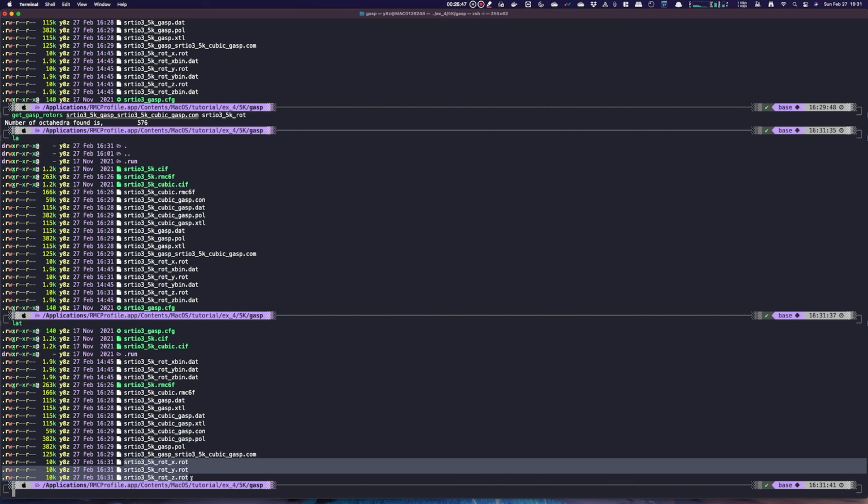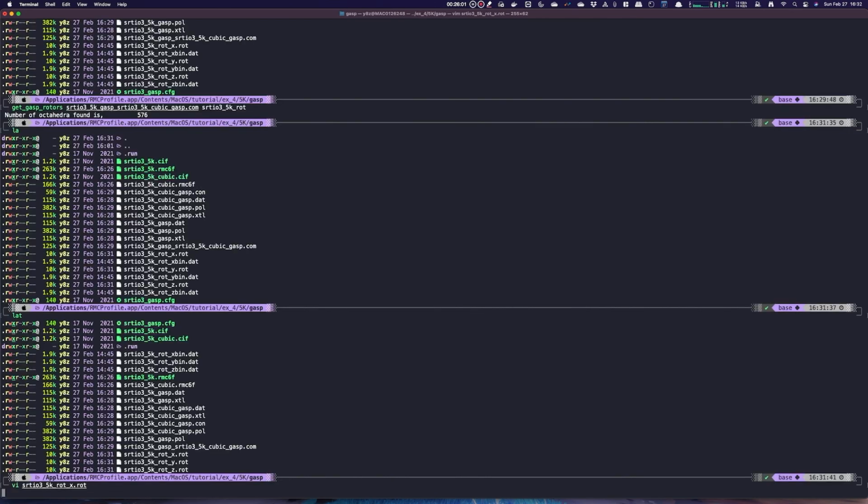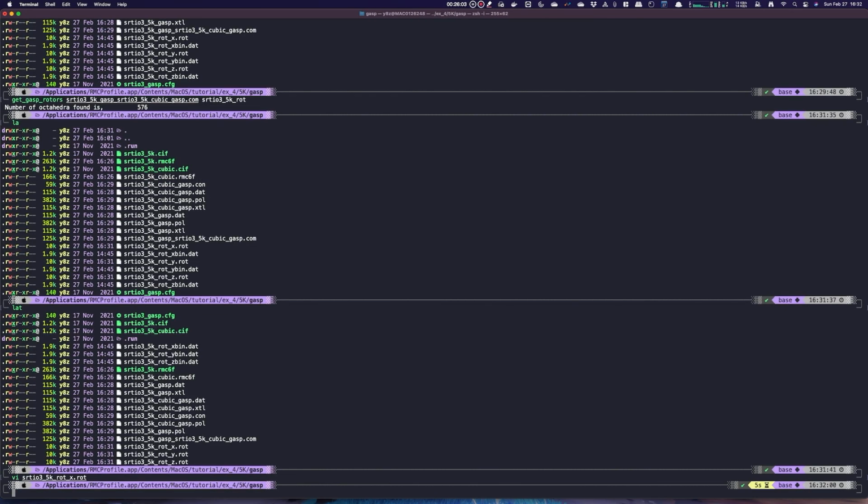And one further step is to transform those files into histograms so we can just plot them. Because if you open those files, they just contain a whole bunch of rotation angles. We want to turn that whole bunch of rotation angle values into histograms, basically binning them into different bins along the x-axis representing the rotation angle, so that we can plot an XY diagram.